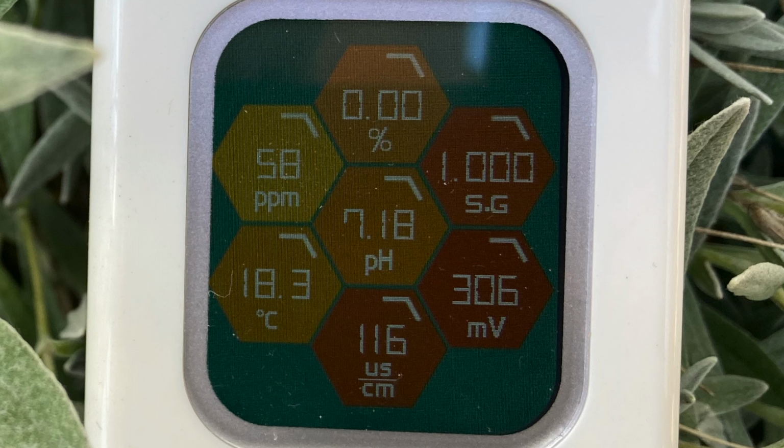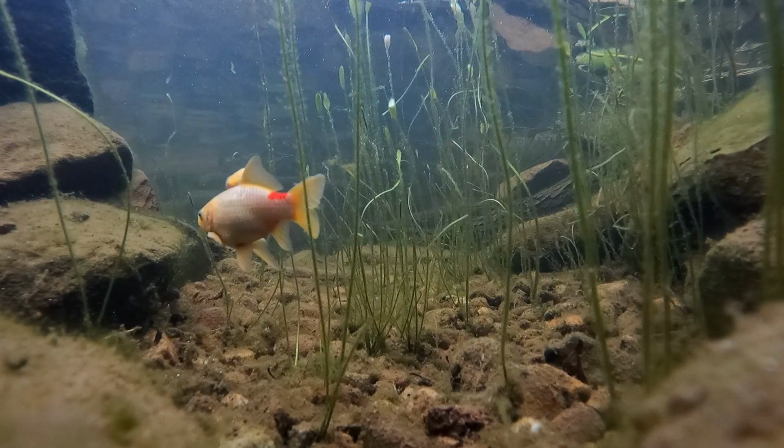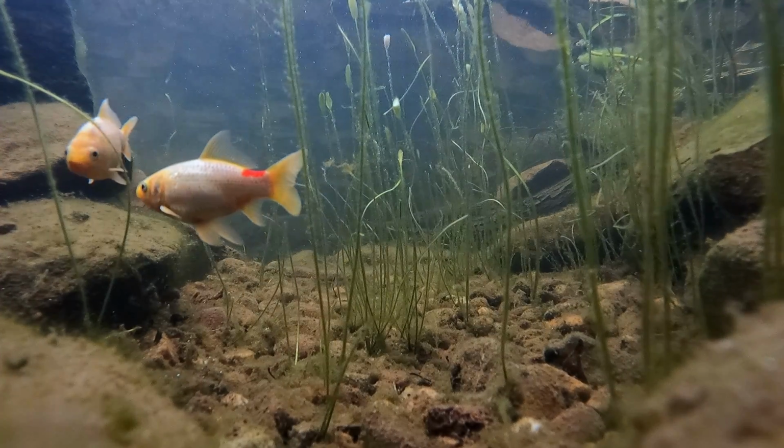Well, they weren't all that different. The pH was still pretty much neutral, the temperature at 18.3 Celsius, a very low TDS at 58, and a decent ORP reading of 306 millivolts. So I can't see anything that jumps out as to why this pond has more algae than the other ponds.